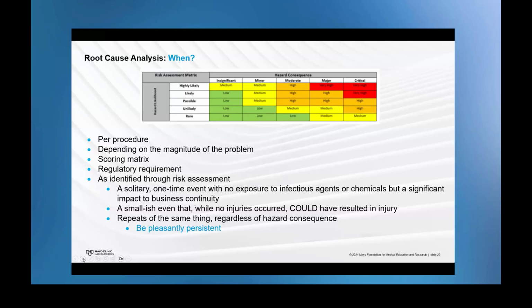I'm not here to call anyone out and say, you should have prepared, you should have gotten the different box cutter. I'm here to say, let's visit about what happened with that other group and what they did and see if it might work for you based on what happened here. Maybe that other group's corrective and preventive action has no place and no chance of working in this new space. But now we've got a dialogue of what might work in the new space.